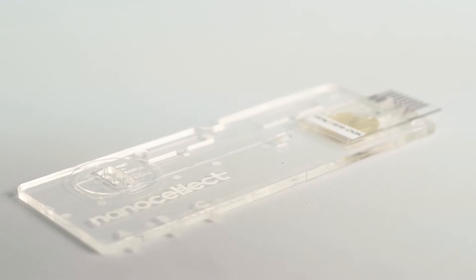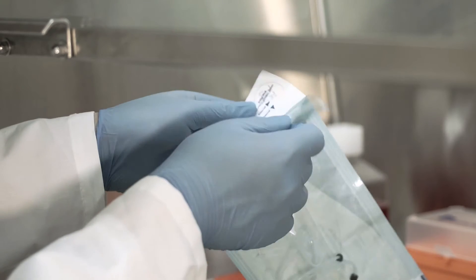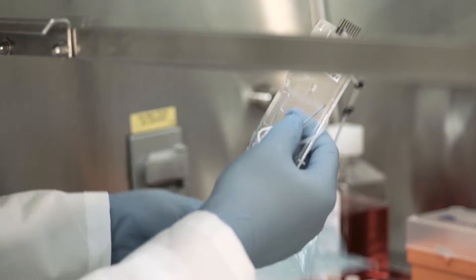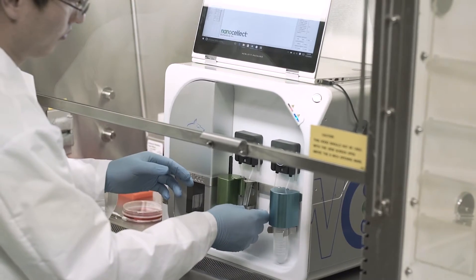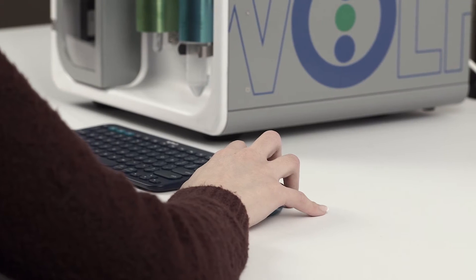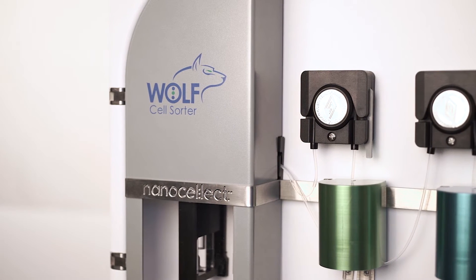This cartridge allows us to have many advantages. The fluidic system is designed so that anything the sample touches is disposable. Your co-workers can each be using the cell sorter at their own pace with their own cells and not worry about cross contamination. And it's much more gentle on the cells so that there's a lot higher cell viability.